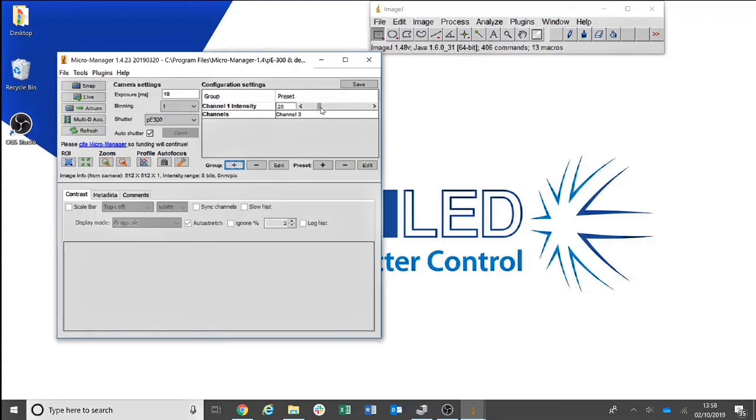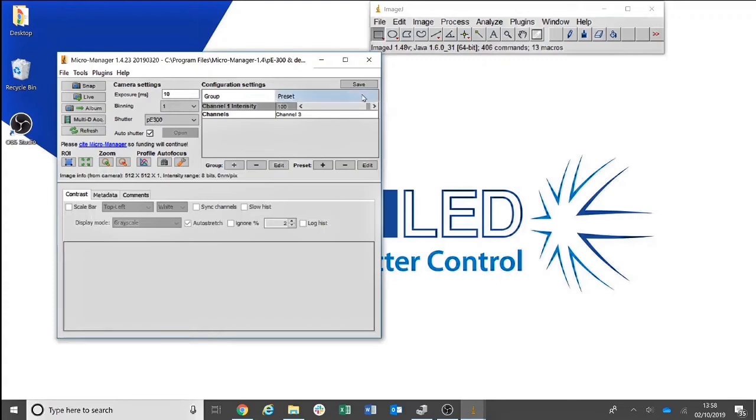You will see here you are then presented with a slider that allows you to adjust the intensity of Channel 1 from anything from 0 to 100. You will see this change also reflected on the control pod.